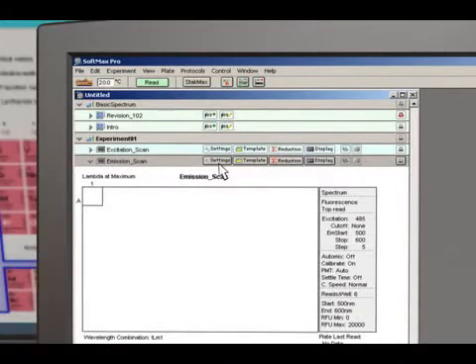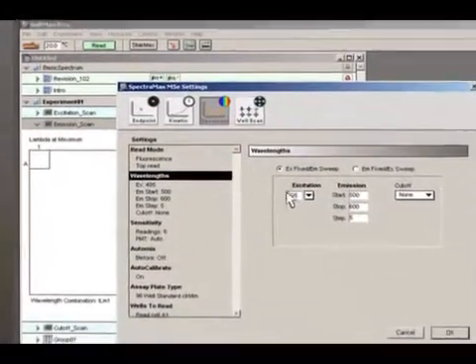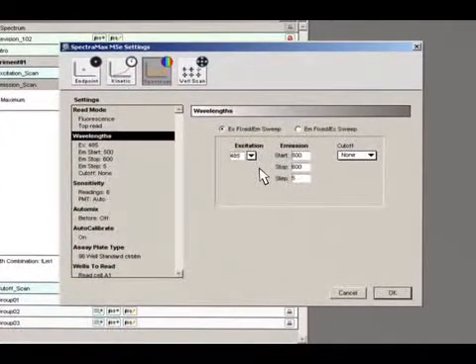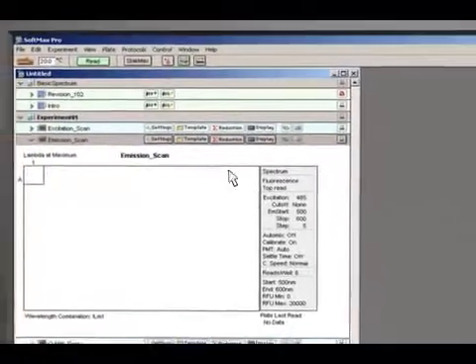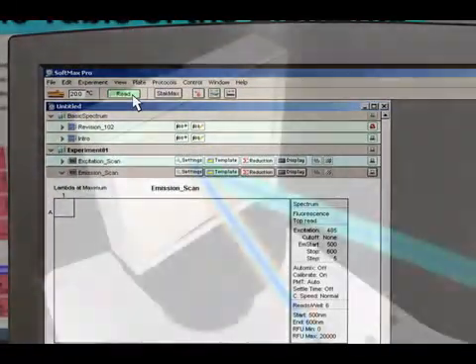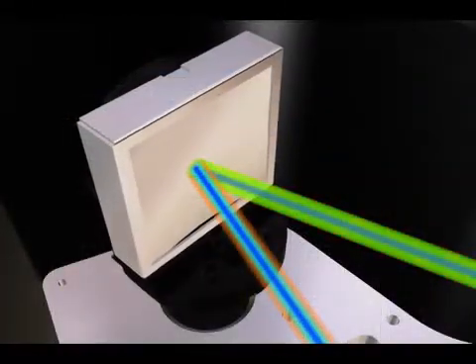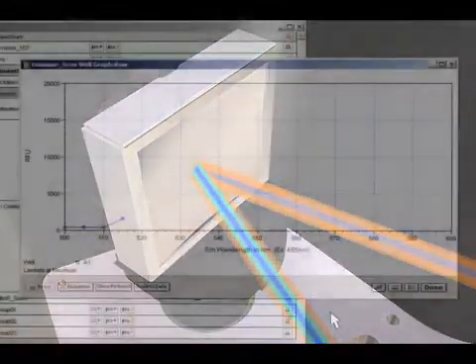Now we do the exact opposite as before. Fix the excitation wavelength with the new value and scan for the proper emission wavelength. The emission scan proceeds and we are presented with a graph of your emission maximum.